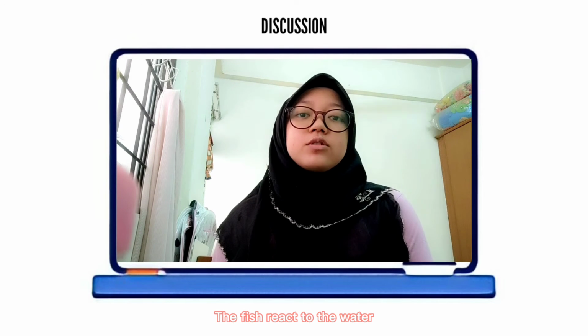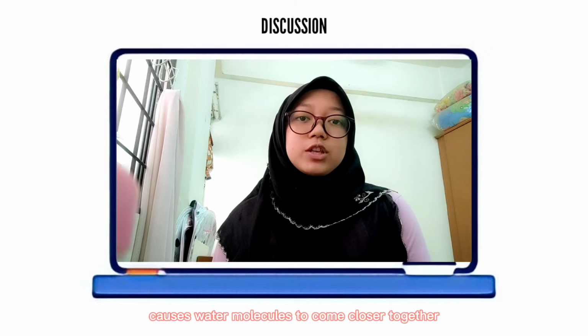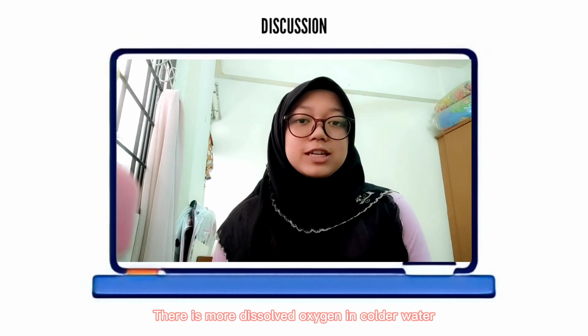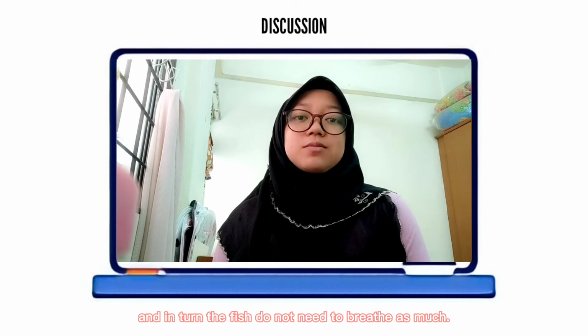The fish react to the water change in this way because cold water temperature causes water molecules to come closer together and trap dissolved oxygen. There is more dissolved oxygen in colder water, and in turn, the fish do not need to breathe as much.